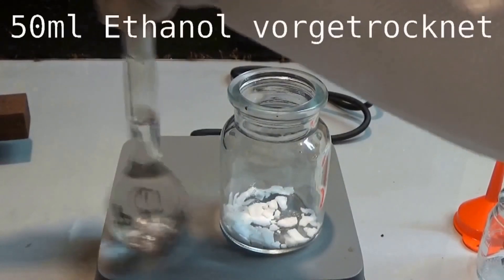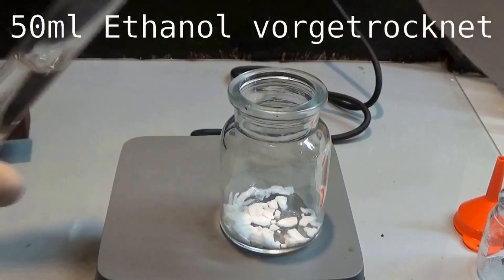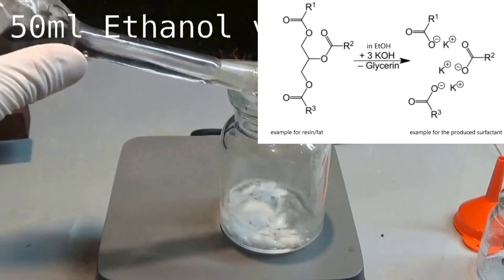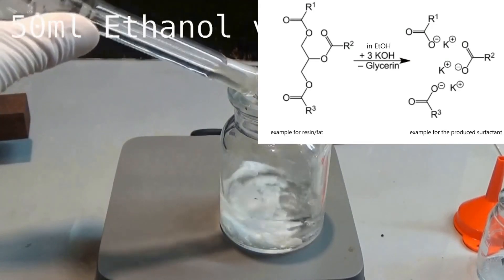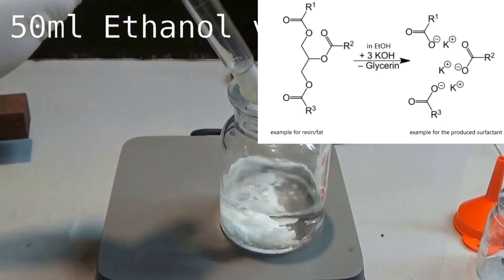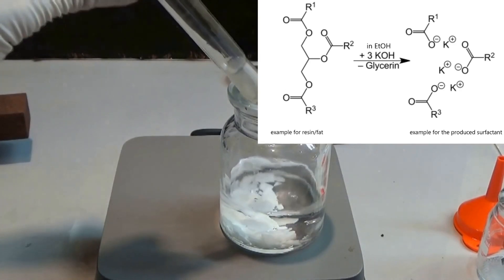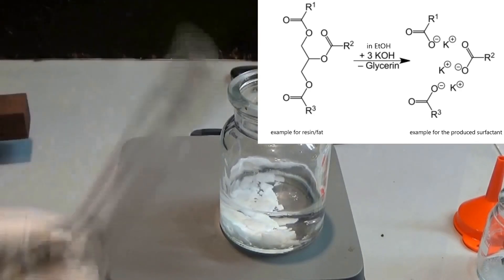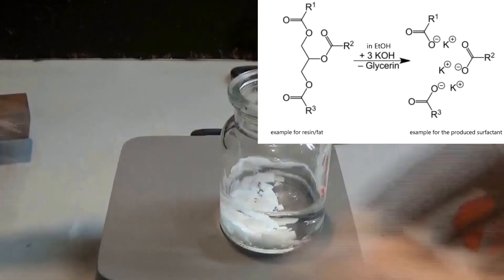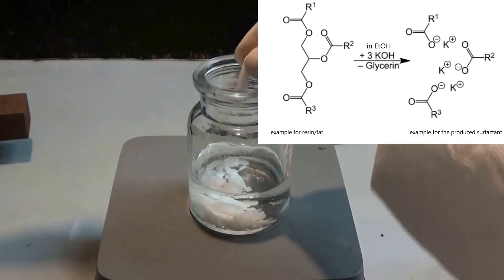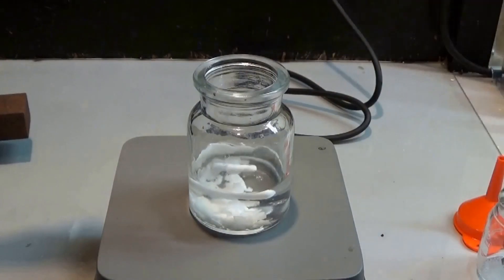The potassium hydroxide solution is used to get rid of most of the resin and fat which we extracted alongside our wanted piperine. The process is very simple and works just like the production of soap. In our case, the hydroxide ions react with the ester bonds in the resin and fat to break them up and form water soluble salts. These are commonly known as surfactants and are better soluble in water than in the used ethanol, which leads to some of them crashing out of solution.